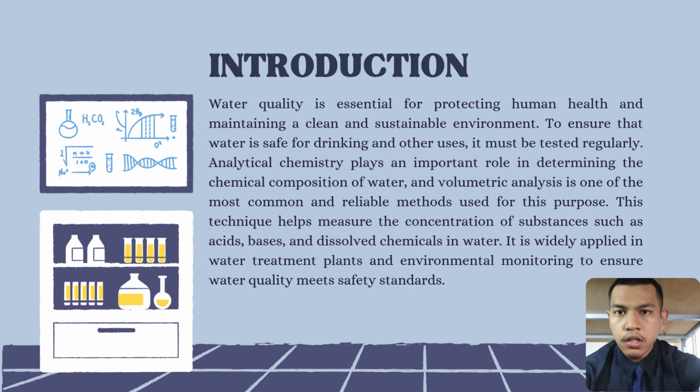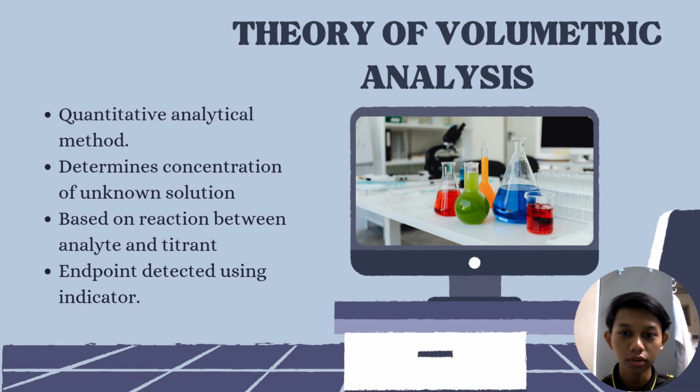It is extensively used in water treatment plants to monitor and control water treatment processes, as well as in environmental monitoring to assess the quality of rivers, lakes, groundwater, and other water sources. Now, let's go to the theory of volumetric analysis.